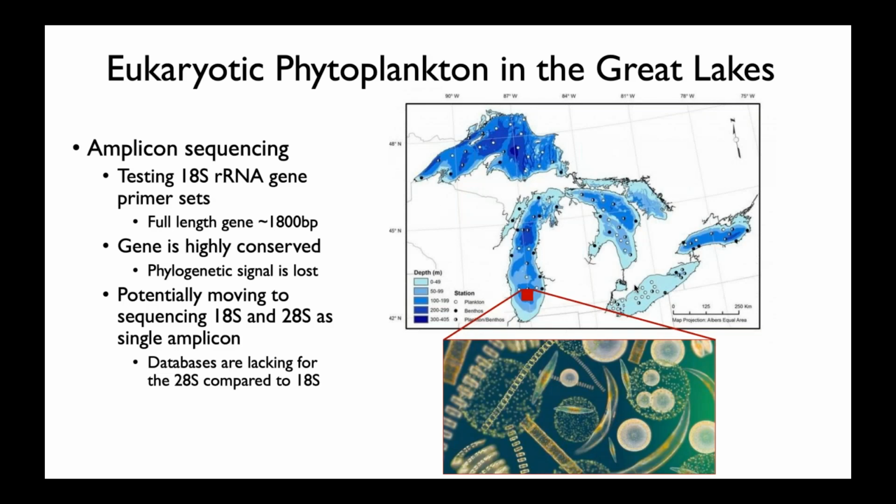So building up in complexity, moving from just these pure cultures that we have growing in the lab to thinking more broadly about microorganisms in the environment, we've started to actually use the PacBio sequencing platform to generate amplicons. So thinking about short reads that we can PCR, we PCR a gene, and we get a full read passed multiple times, so we get a high quality amplicon sequence that we can use to look at distribution of organisms across an environment.